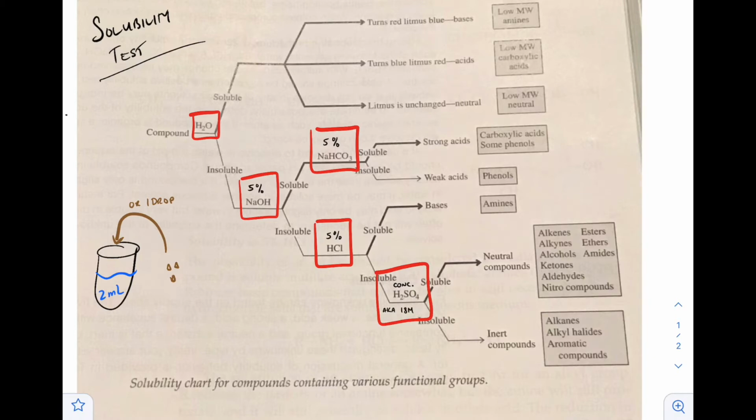You also want to be careful with the solid. If you have large chunks or crystals, you're going to want to grind them, so hit that with the mortar and pestle. The mortar and pestle is going to be your friend. It makes fine particles, which will more easily dissolve because you're increasing the surface area. Once it dissolves, add a little bit more. This helps you identify approximately how soluble it is, mildly soluble or super soluble, because that helps identify what type of functional groups you have. Is it a super polar compound, not polar at all, or mildly polar? This is very helpful information, and ultimately the goal that we're trying to gather.